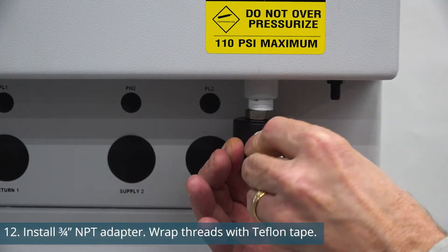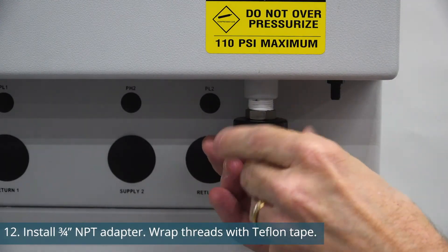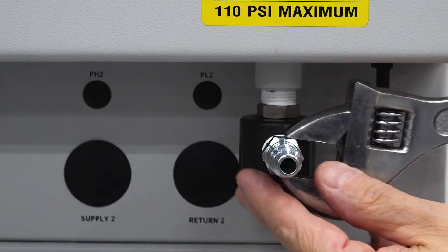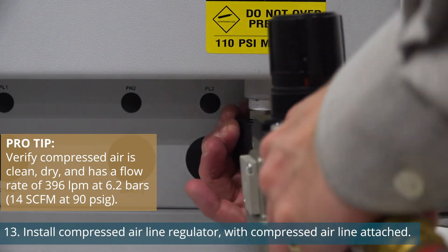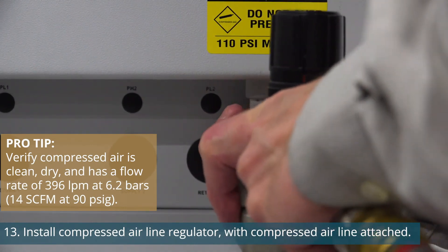Install the 3/4 inch NPT adapter. Be sure to wrap Teflon tape around the threads and make sure it's snug with an adjustable wrench. Then connect the optional compressed air regulator with the compressed air line already attached.